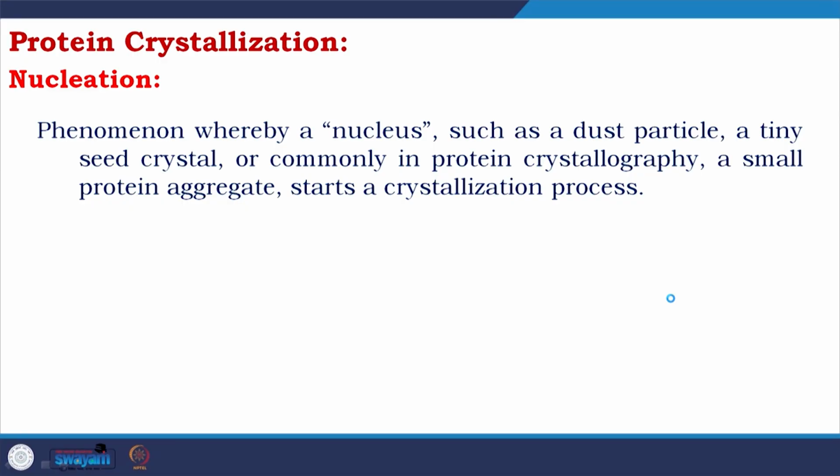Nucleation, as I told you, is a very important term. It is the phenomenon whereby a nucleus, such as a dust particle, a tiny seed crystal, or commonly in protein crystallography a small protein aggregate, starts a crystallization process.